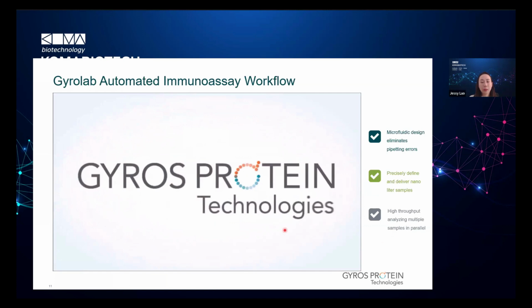So that's the whole process of how it analyzes the sample. All the things you see are automatically handled by a needle and an arm chamber. The only thing that wasn't explained here is that once every sample is added, there will be a procedure to wash the needle to reduce or eliminate the contamination risk.